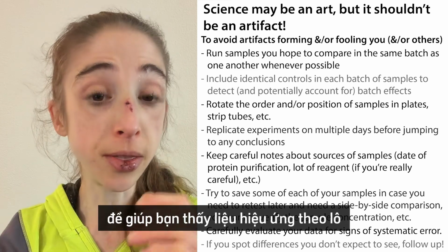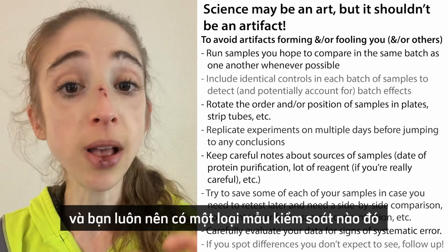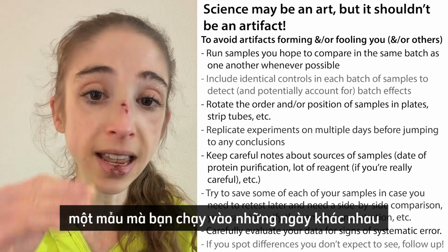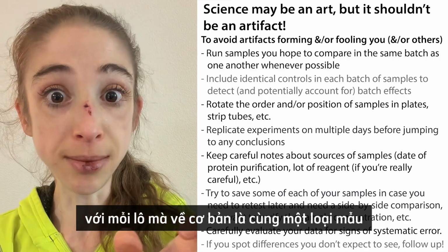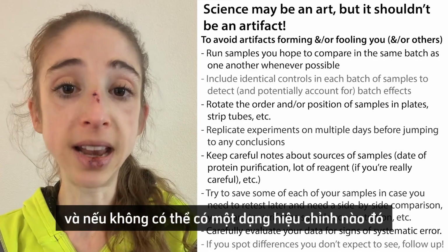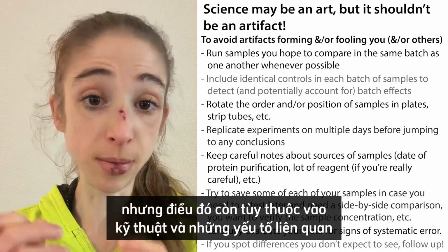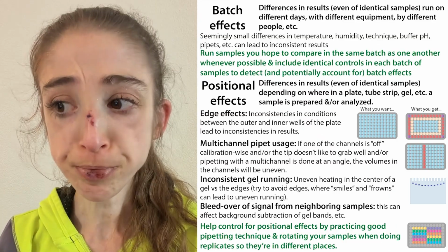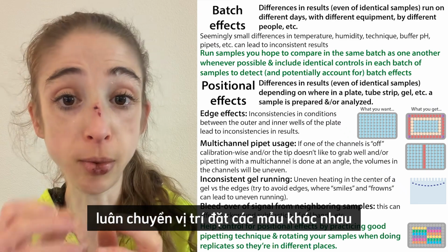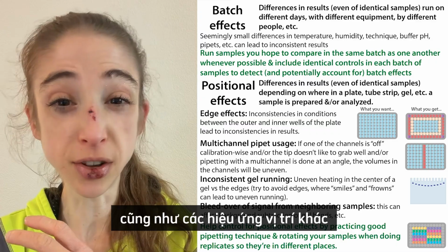To help you see whether batch effects are occurring, you could run your samples on multiple days, and you should always have some sort of control sample that you run on different days with each batch that is the same thing, so that you can see, okay, I should be getting the same result with these, and if not, maybe there is some sort of correction I can do after the fact, but that just depends on the technique. What you can do, however, is in each of your batches, rotate where you put different samples. And this gets to things called edge effects, as well as other position effects.